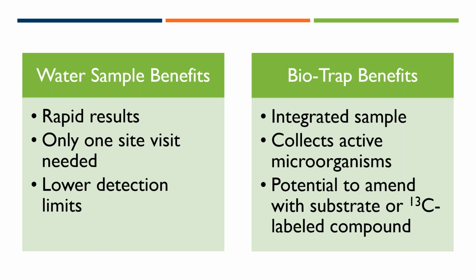And biotraps also allow us to perform some unique testing with amendments in situ. They can be amended with a remedial substrate to assess its effectiveness prior to injection, or with a carbon-13 labeled compound to demonstrate that the contaminant is biodegrading under current site conditions.